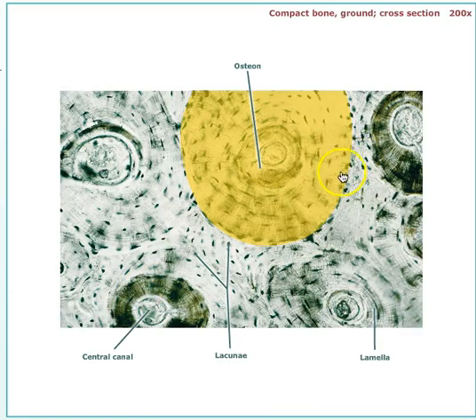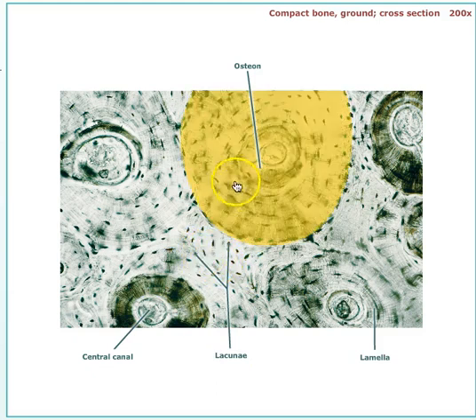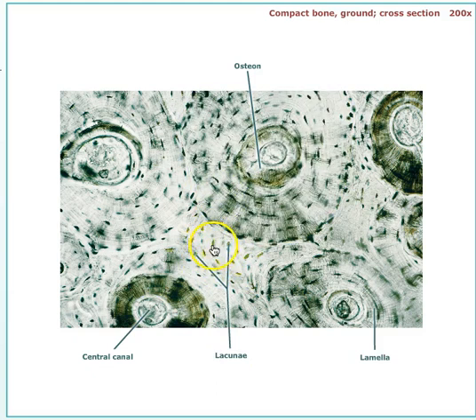This is a much better view of it. There's that unit again, the osteon, and there's your Haversian canal or central canal, and you have these lacuna as well. And it's just giving more of a passageway for the blood supply and nerves to pass through the bone.